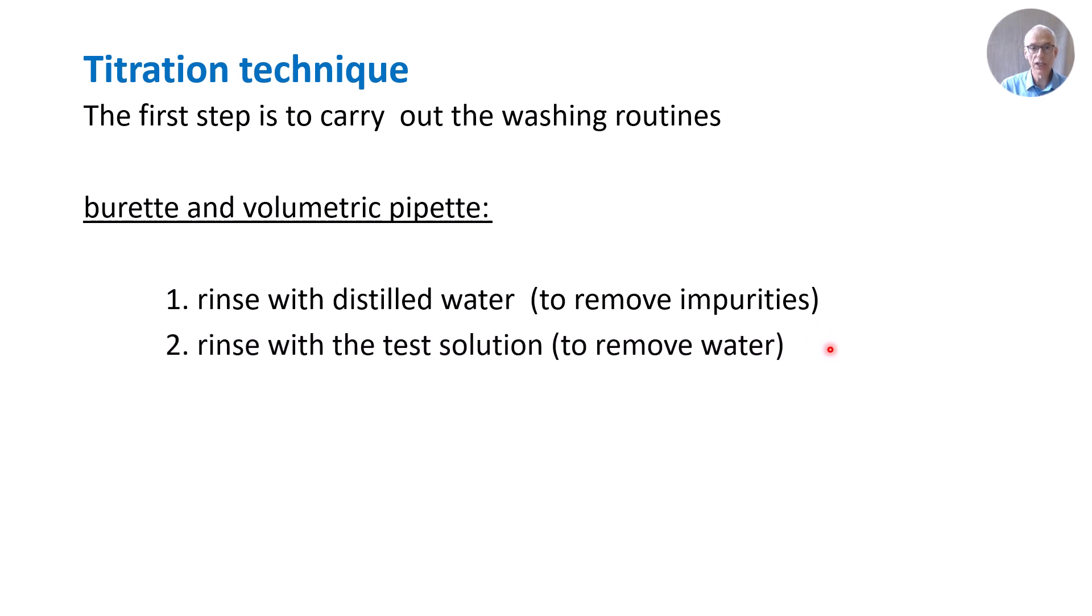Then rinse with the test solution. We need to remove any distilled water that remains in or on the glassware. So rinse with distilled water removing impurities, then getting rid of any excess distilled water by rinsing with the test solution.